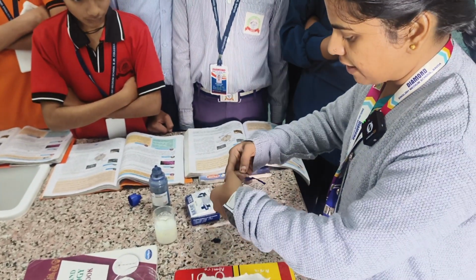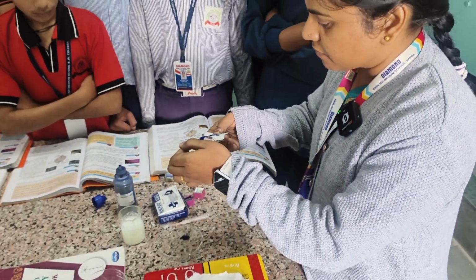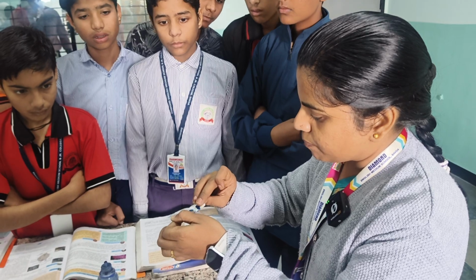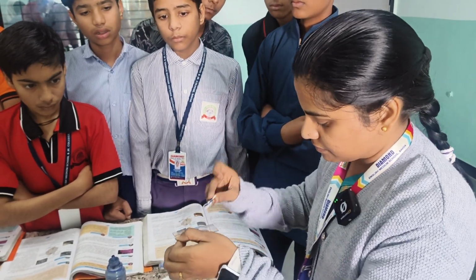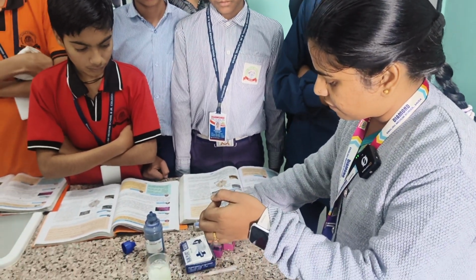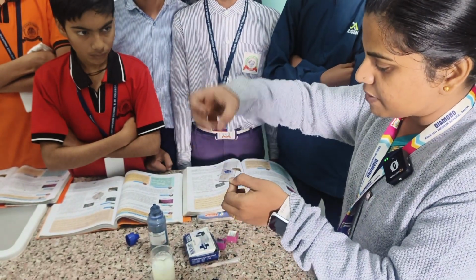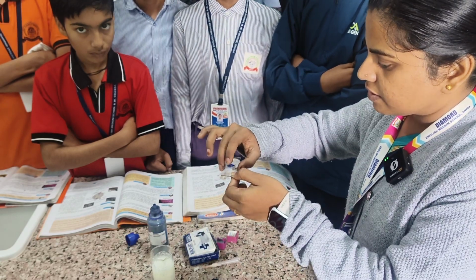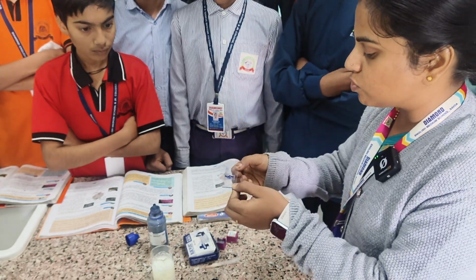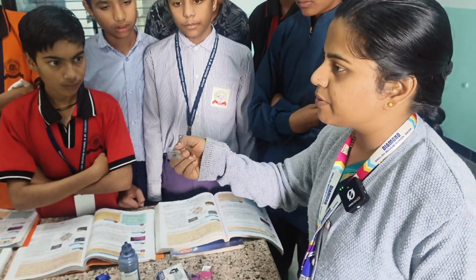We have to dry this slide with the help of blotting paper, so that our smear becomes thin and we can observe the lactobacilli properly. Now what do we have to do? We have to put this cover slip on this smear. We have to put the cover slip properly so that air bubbles cannot enter the smear. Now this is a temporary slide.